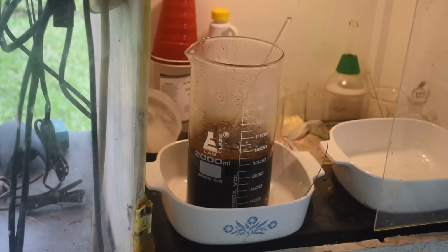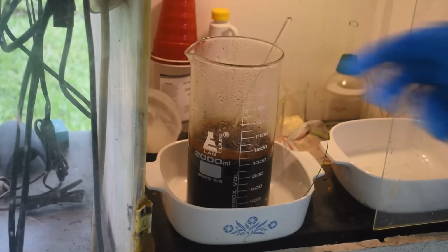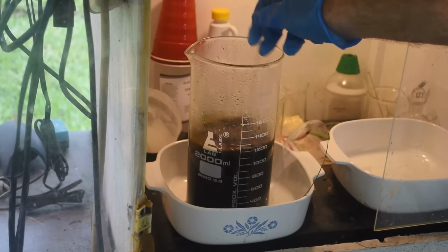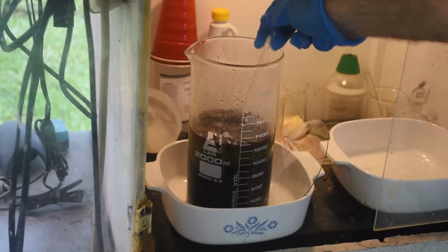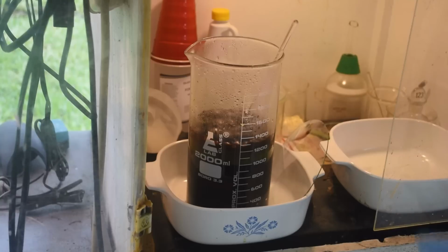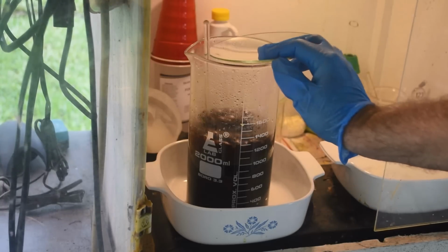I'm going to put a little bit more in just to make sure that the reaction has gone to completion. And then leave it at that. Oh yeah, see the bubbling? If you're not careful, you can add enough of this stuff, it will just shoot right out of the top of your beaker. You saw how little I put in there.